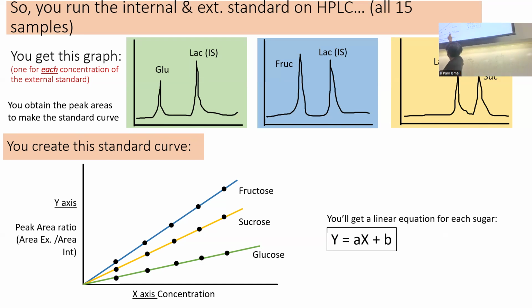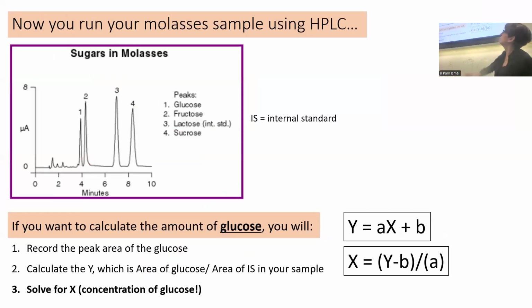And you plot a standard curve for each one of them. So you will have 3 different standard curves, and all of them account for the internal standard.